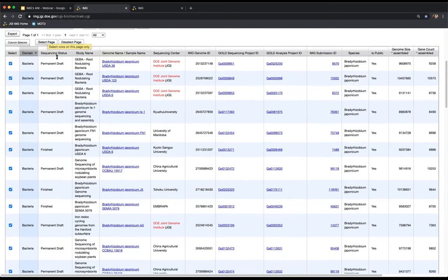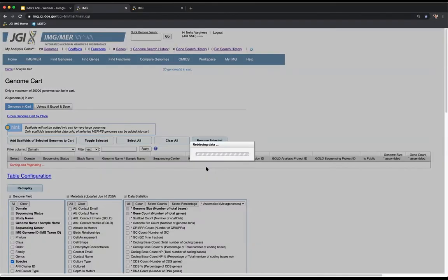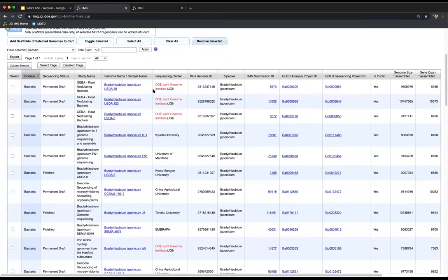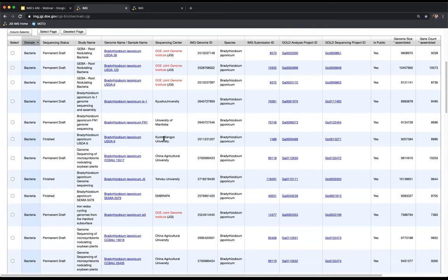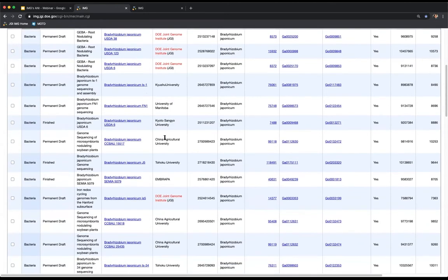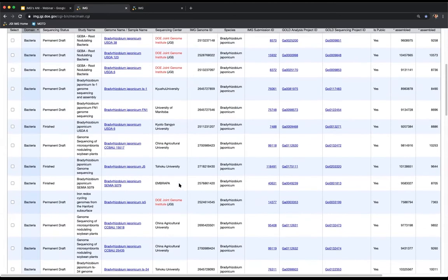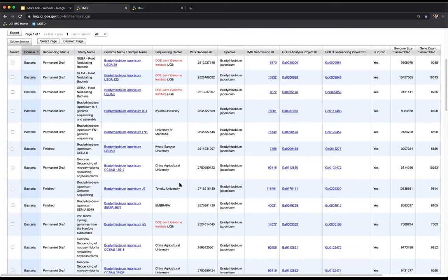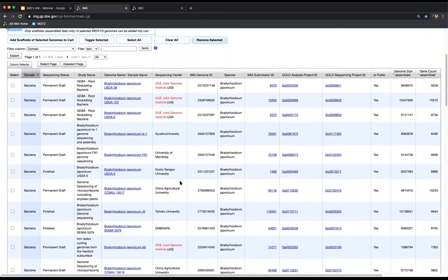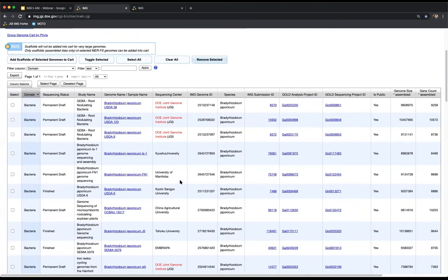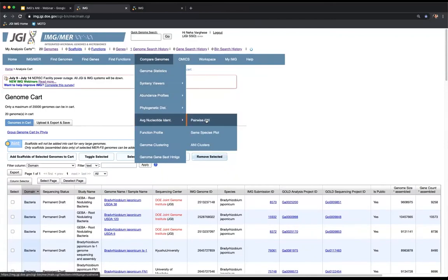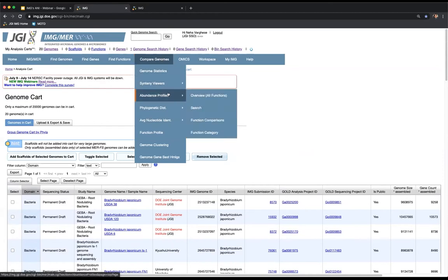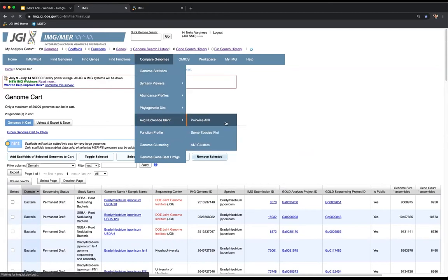I'm going to select this page and add all selected genomes to the genome cart. Although these are all the same species, one of the things we would like to know is whether they are similar in genome identity. In many cases, taxonomy assignment is done solely using the 16S gene, so there is a need to examine the genomes in detail to ensure a high-confidence set. ANI allows you to determine if there is possible contamination or incorrect naming. To do this, go to Compare Genomes, Average Nucleotide Identity, and select Pairwise ANI.